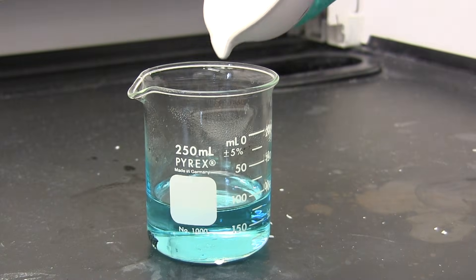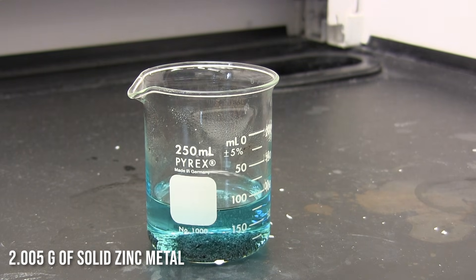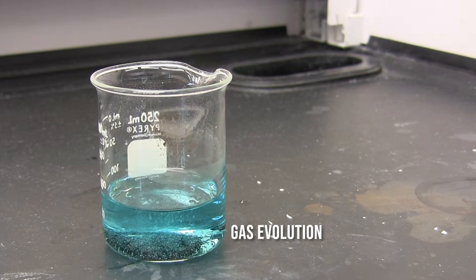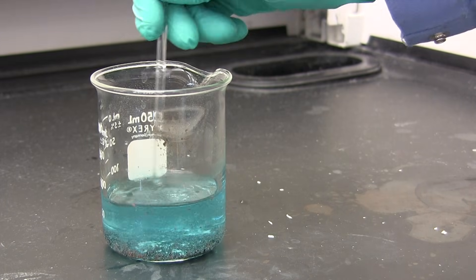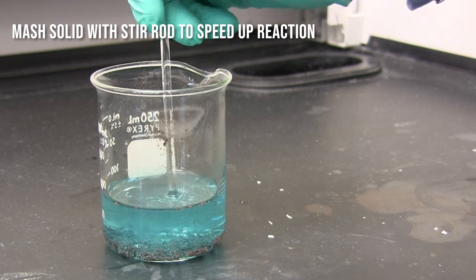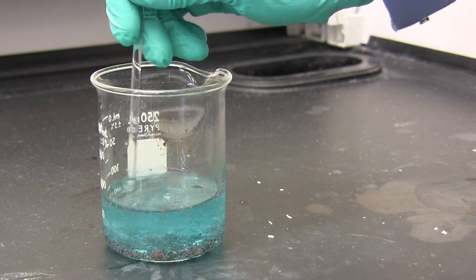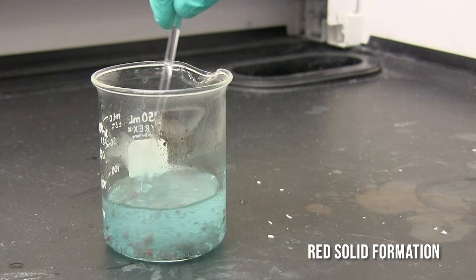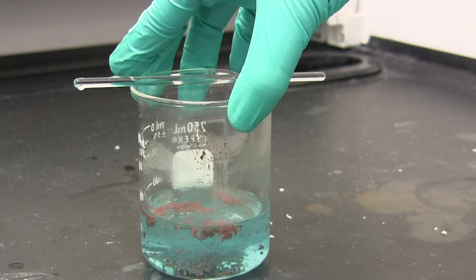So I'm going to go ahead and add some zinc metal — about 2 grams going into the reaction beaker. If you look closely, you can see there is gas evolution coming from the zinc metal. I'm going to give it a little stir to try to speed up the reaction, mashing the zinc to get it to react a little bit quicker. At this point, you may be noticing that there is a red solid forming within the beaker.